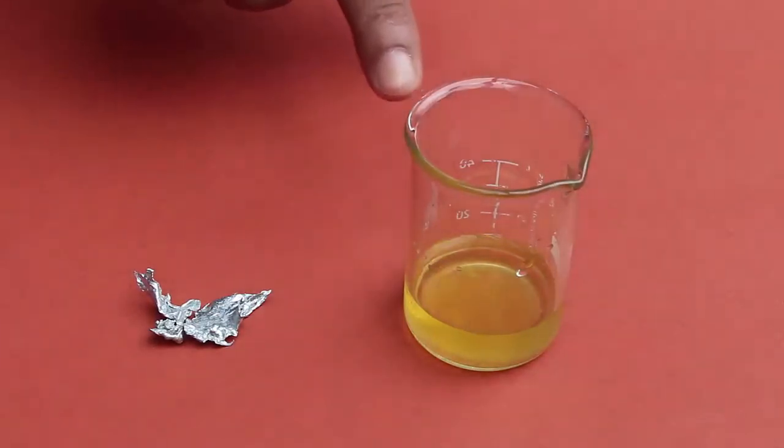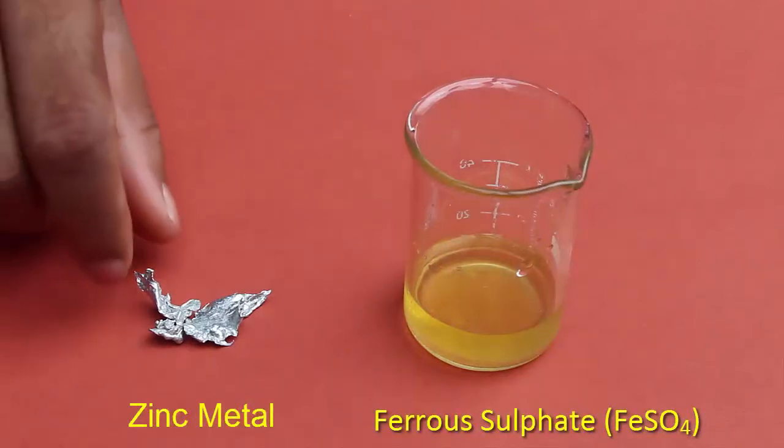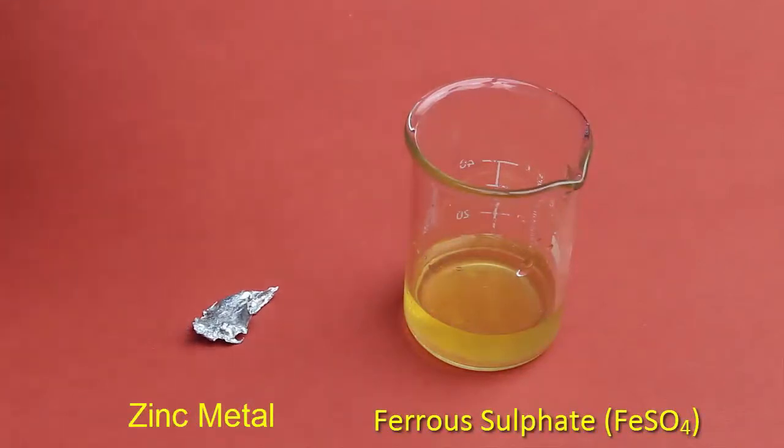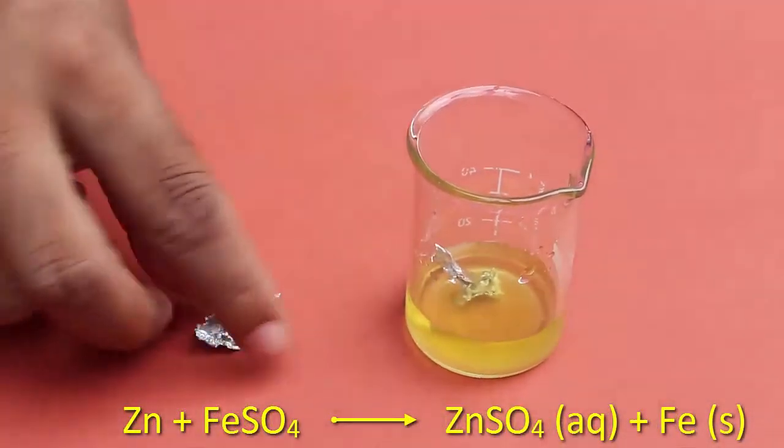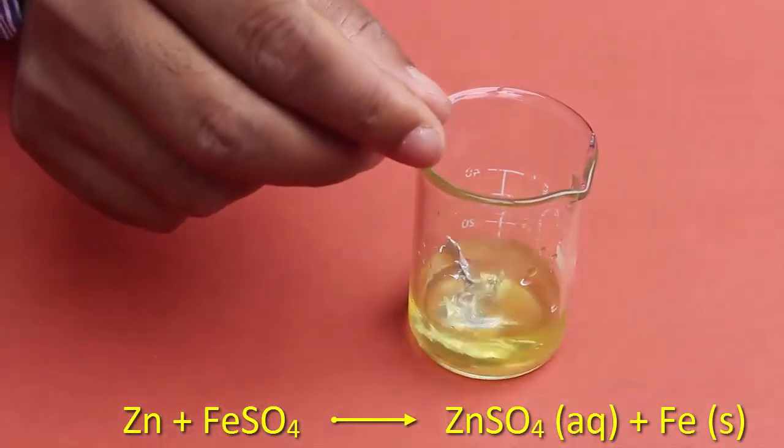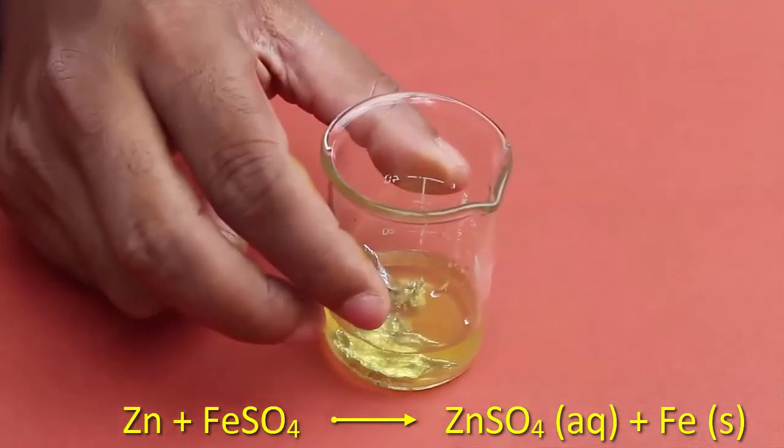Now to this solution of ferrous sulfate, we will add a few pieces of zinc metal. You will have to wait for a while because it will take a little time before the reaction starts.